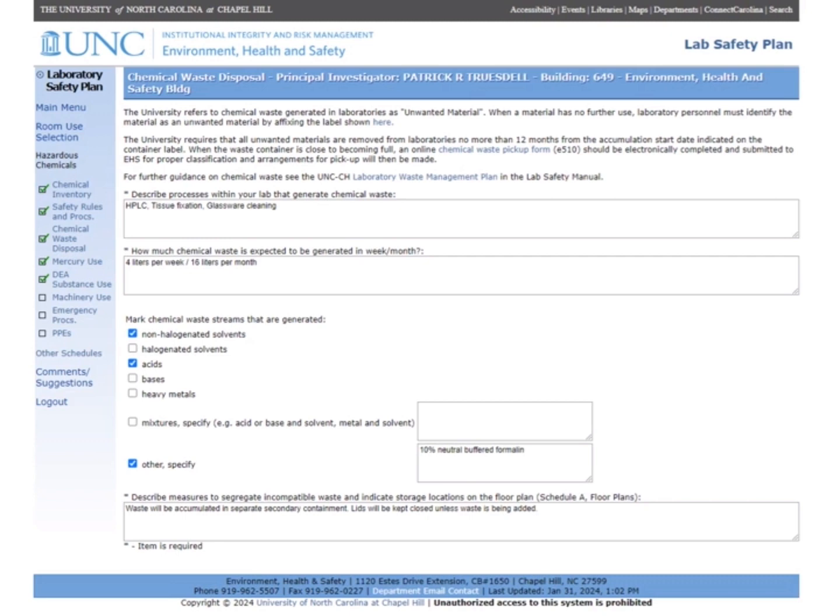Non-halogenated solvents are organic compounds that do not have a halogen attached to them. Halogens are a group in the periodic table of elements that include fluorine, chlorine, bromine, or iodine. Examples of non-halogenated solvents include methanol, acetone, ethanol, hexane, toluene, and xylenes. Halogenated solvents are those that do contain halogens. Examples of halogenated solvents include chloroform, bromoform, and dichloromethane.